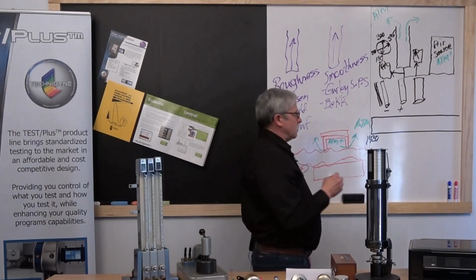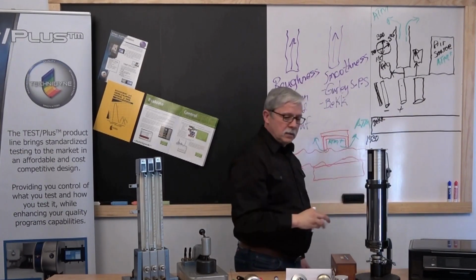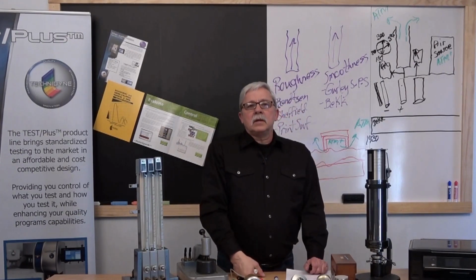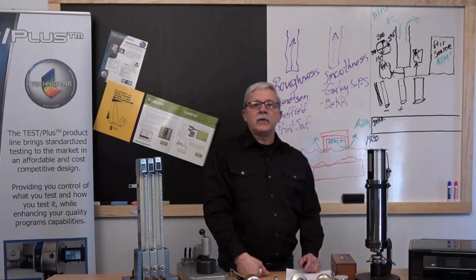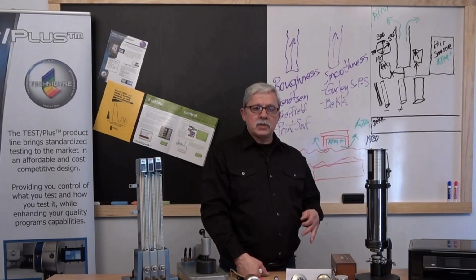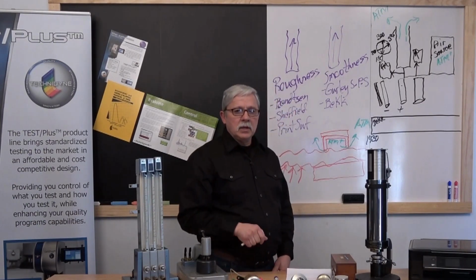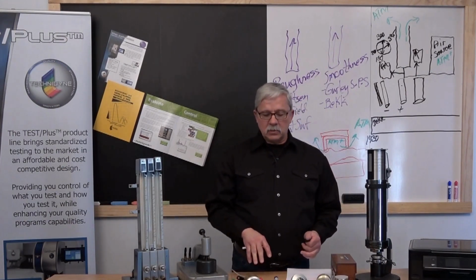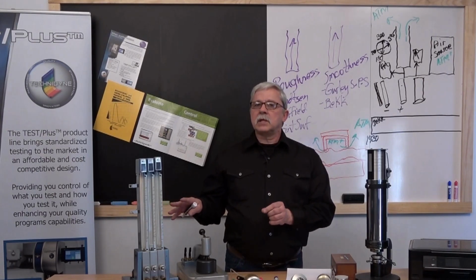That particular test was a Bekk test, B-E-K-K. Julius Bekk was the designer of that particular product. He was the first one to take a look at trying to utilize what they did and what they used in other manufacturing areas and try to utilize that particular process or that technology in the pulp and paper industry. So he had one idea. He was a European. His particular product didn't really make it as far as marketing and sales into the U.S.